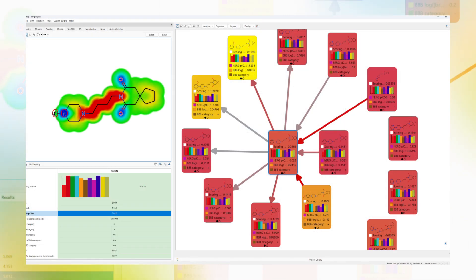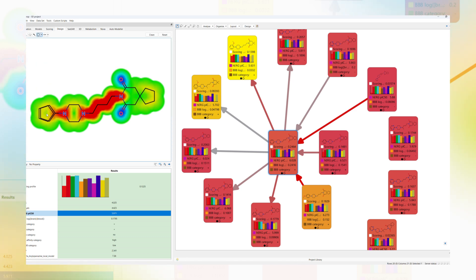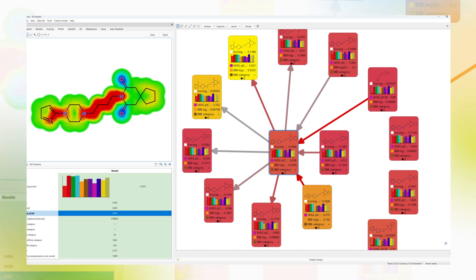Having learned from the SAR of your current data, move seamlessly to design new compounds guided by instant feedback from predictive models and the glowing molecule.